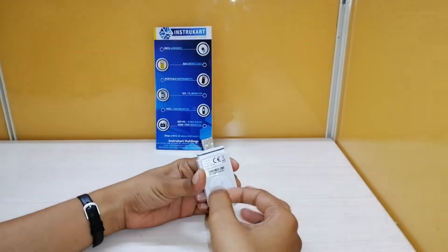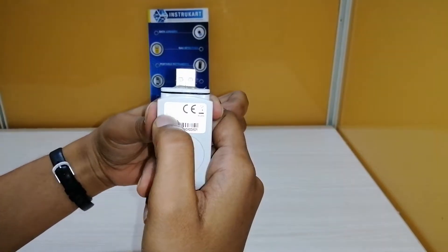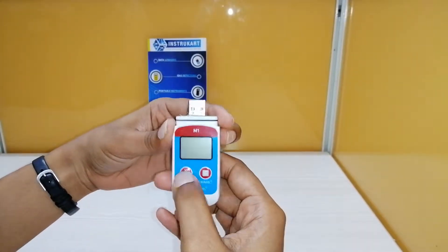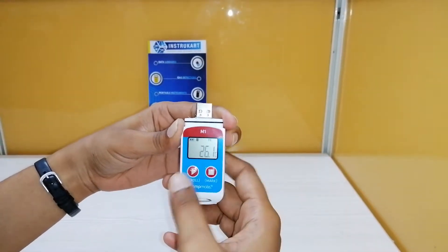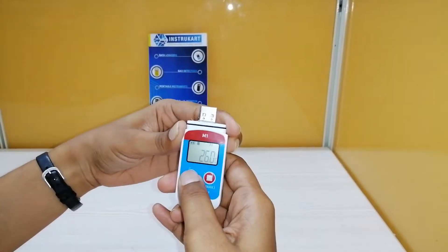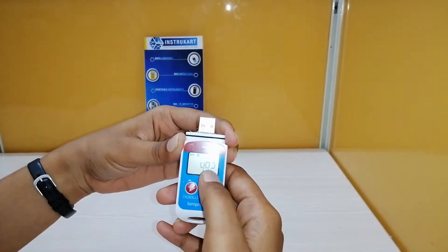Here you can see the model number and part number, and this is the serial number of the data logger. This is the LCD display and there are two keys — this is to start the data logger and this is to stop it. You can see the battery indication, the current temperature in degrees Celsius. It is in pause mode, and this shows how many recordings have been recorded so far — 492.